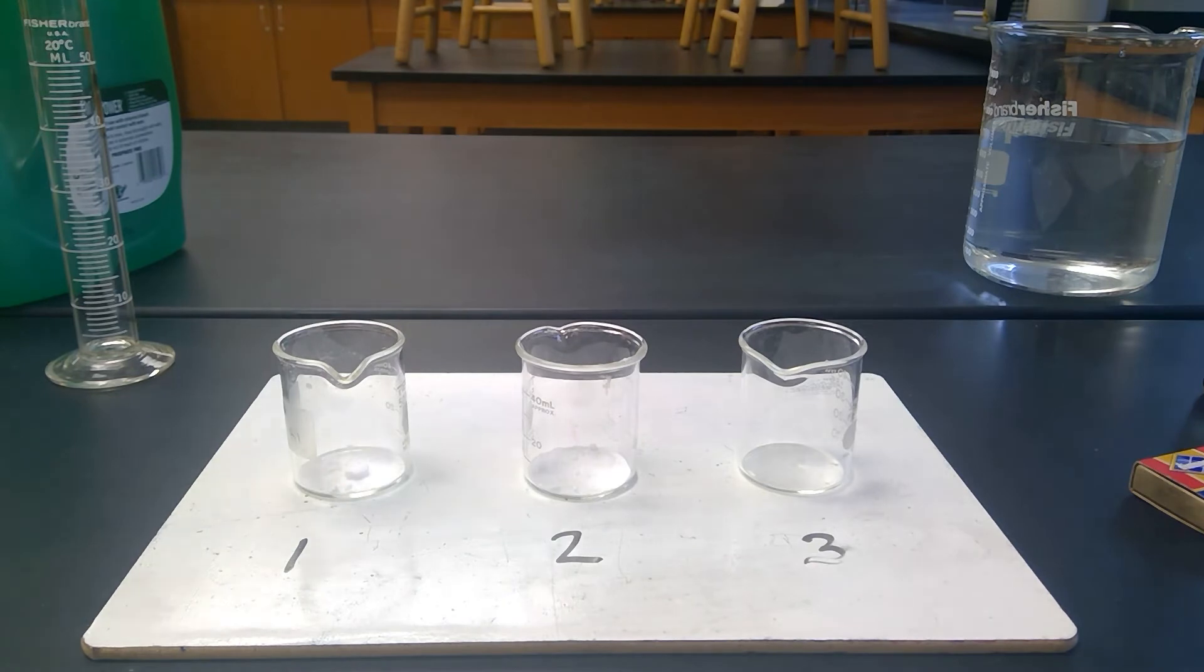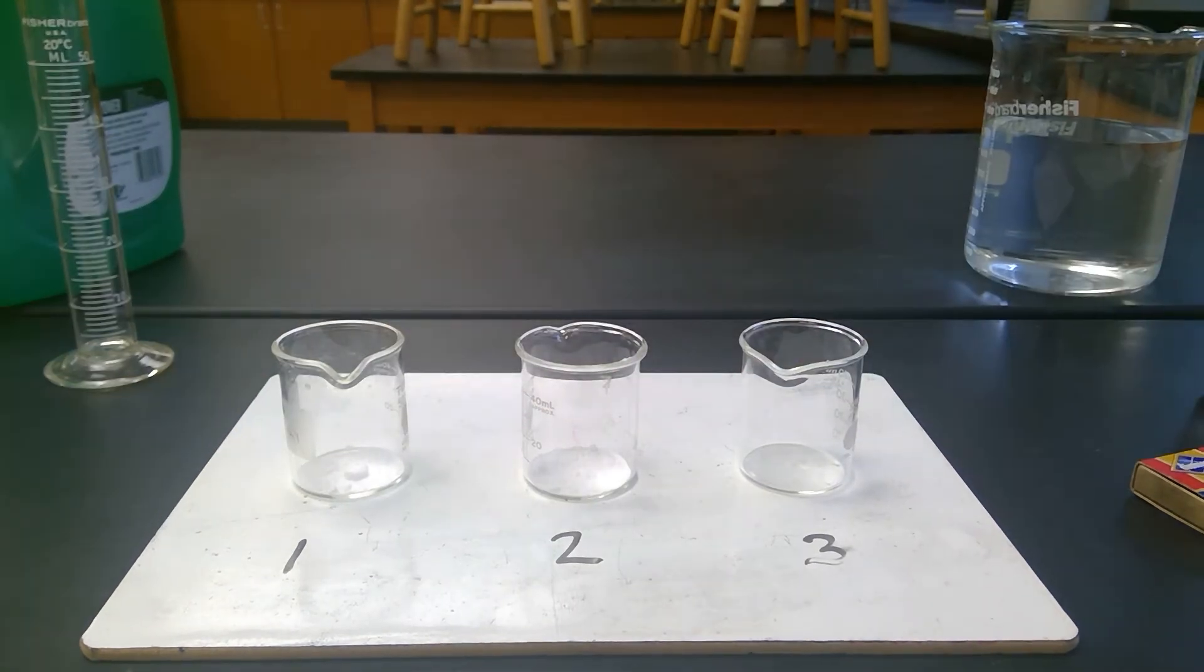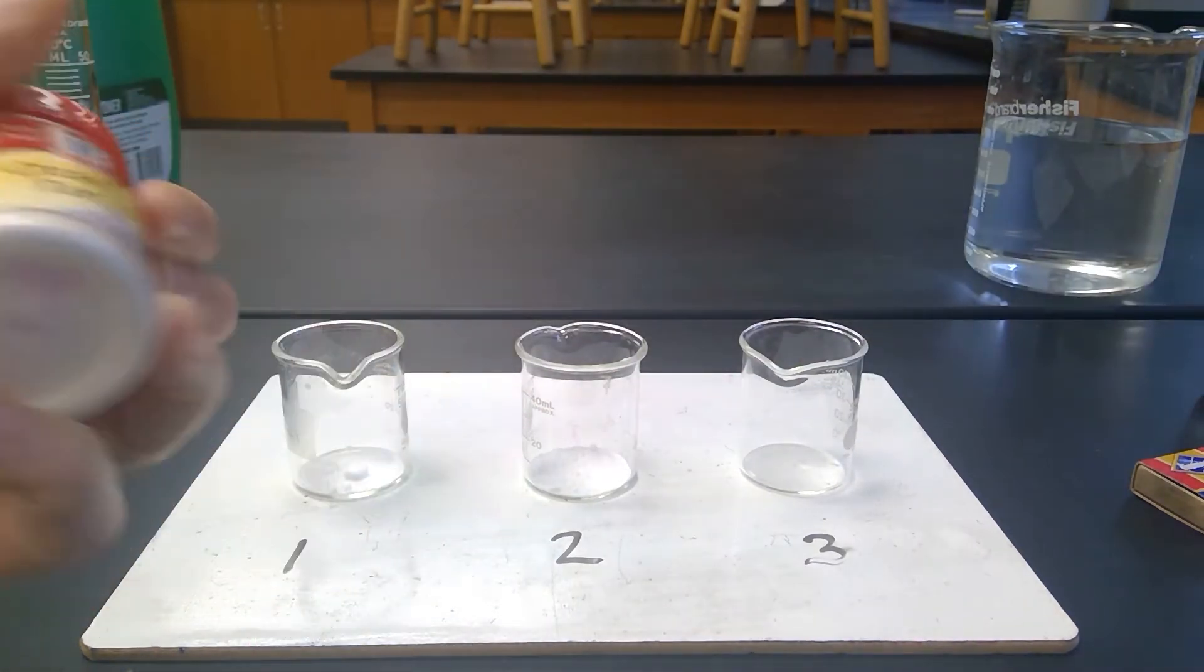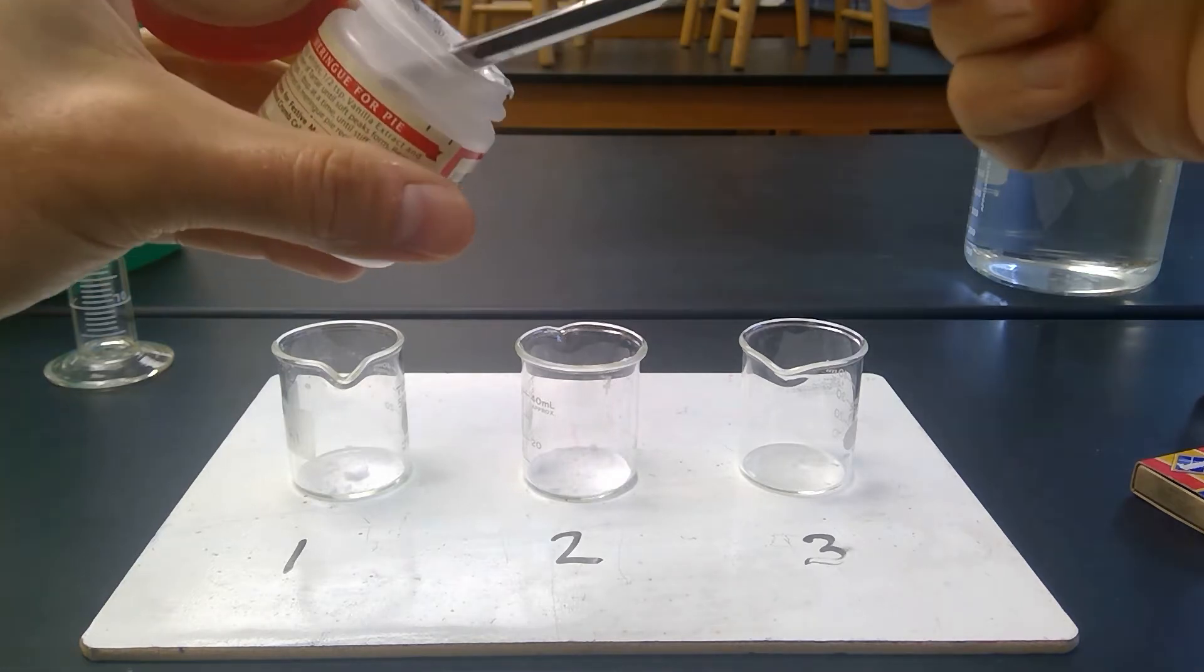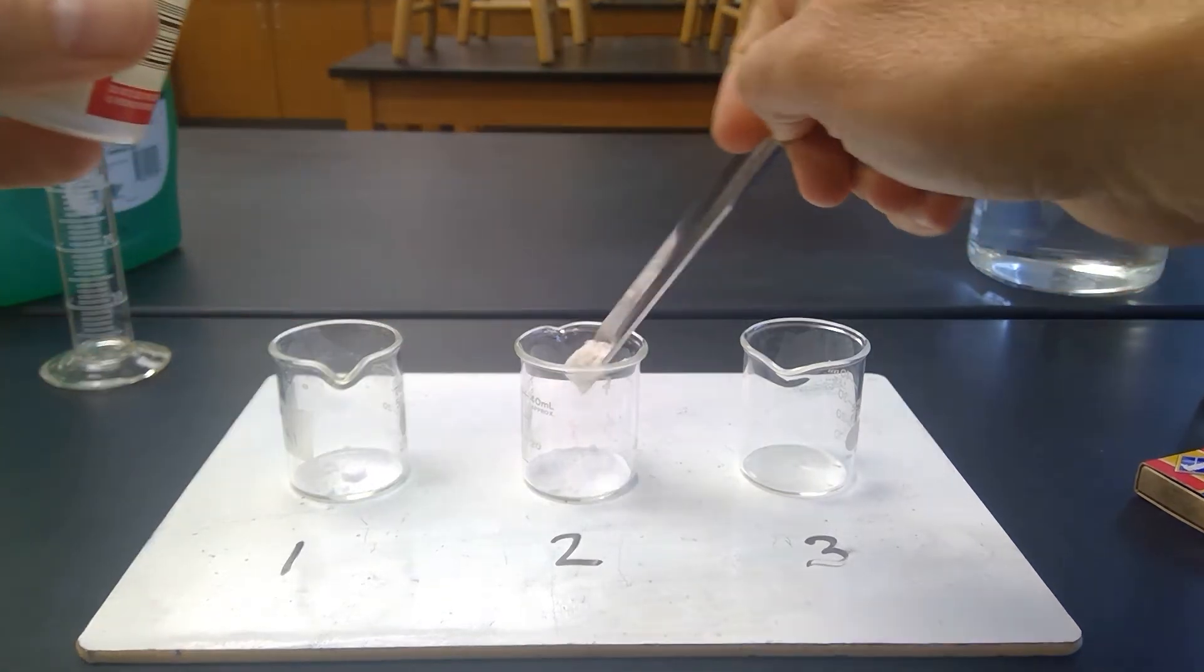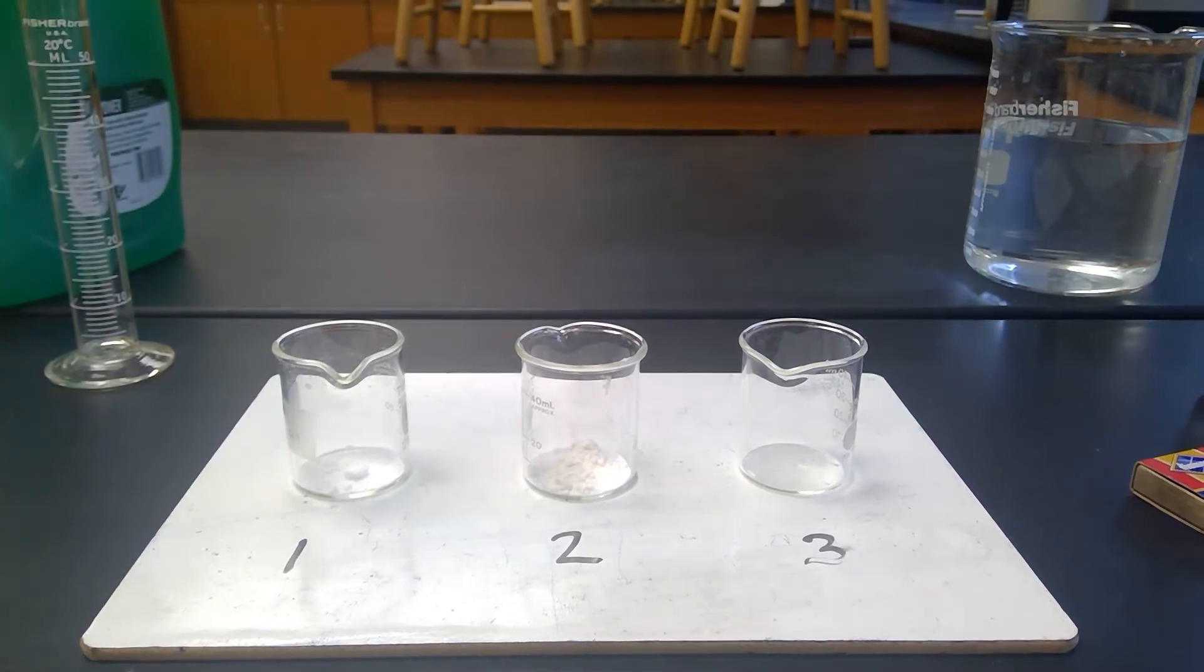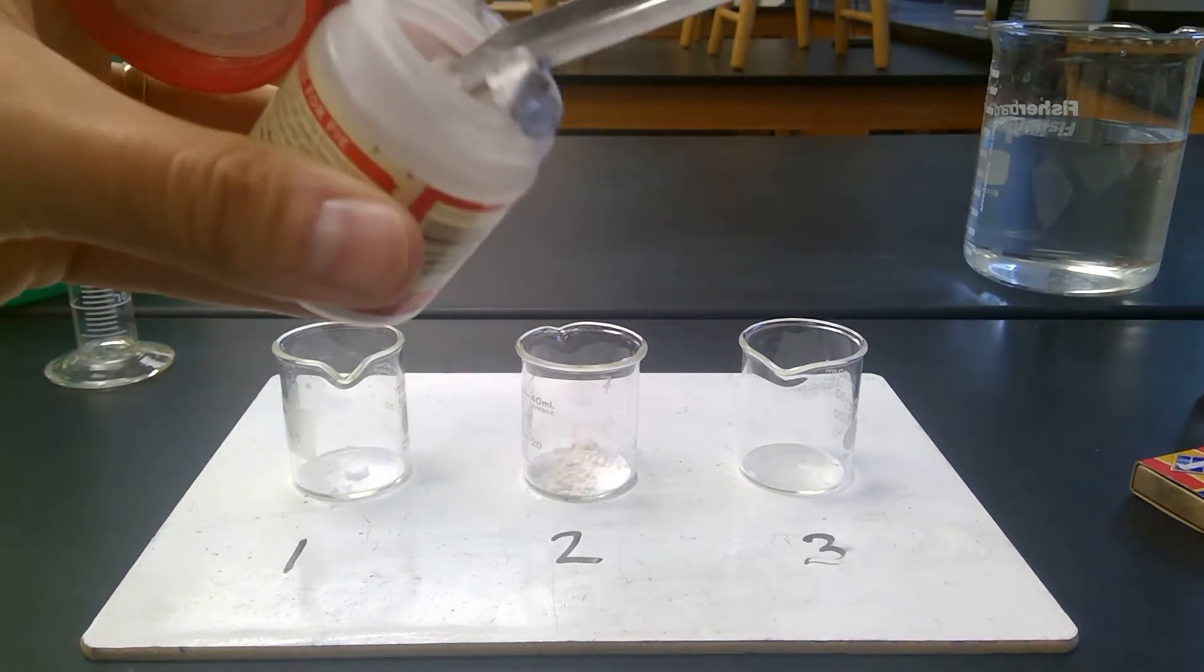And then I have a separate scoopula for cream of tartar. This is cream of tartar. It's something that you add in dishes as a thickening agent. There's cream of tartar. And then in number three, I'm going to add two small scoops of cream of tartar.